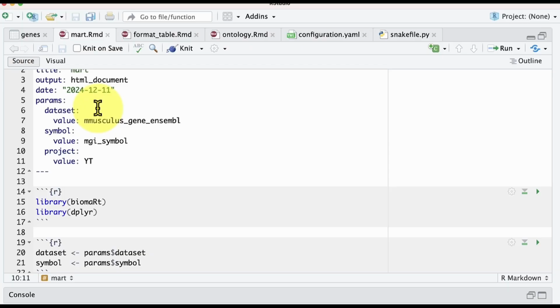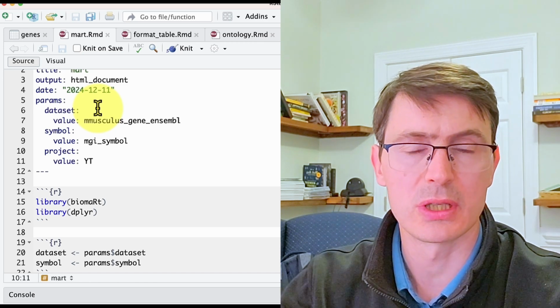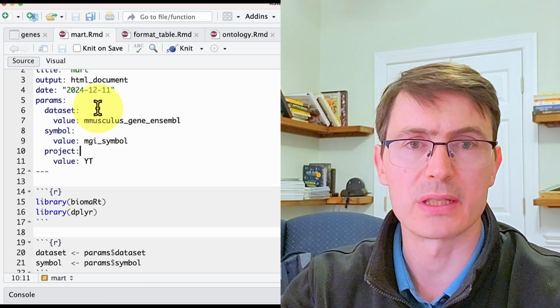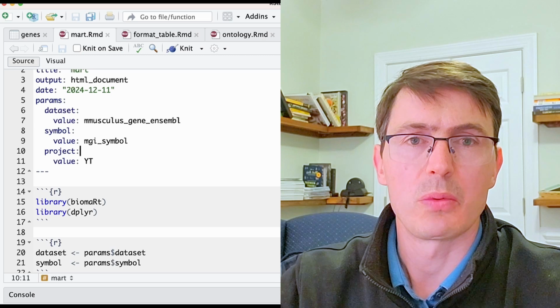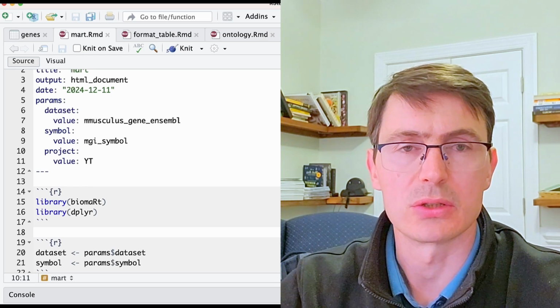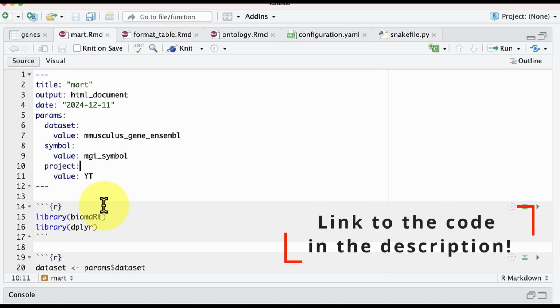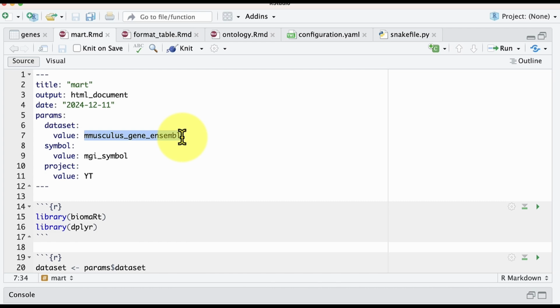There is a lot to unpack, so let's move to the first step, that is to get the mapping between gene symbols and our differentially expressed Ensembl transcripts. To this end, we will use the biomaRt package to download the most current annotations. So first we specify the dataset that we want to retrieve. In our case, it will be the mouse gene annotation.